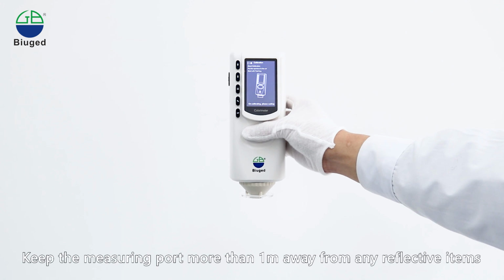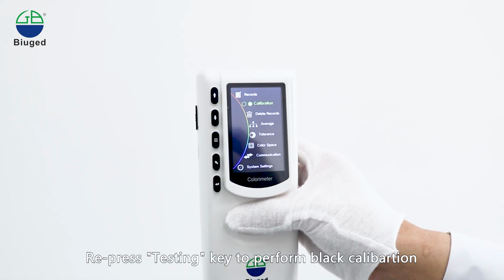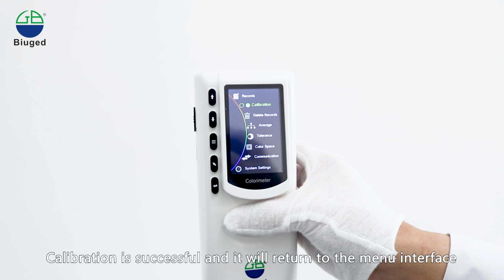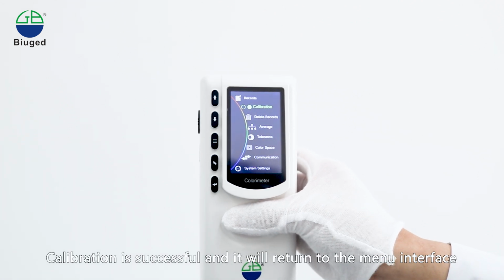Keep the measuring port more than 1 m away from any reflective items. Press the testing key again to perform black calibration. Calibration is successful and it will return to the menu interface.